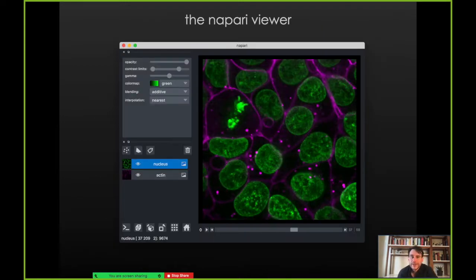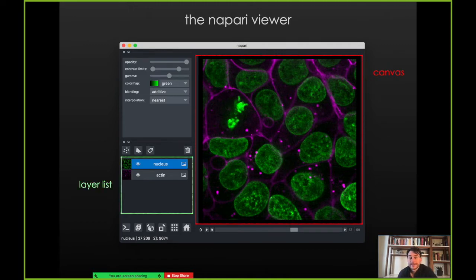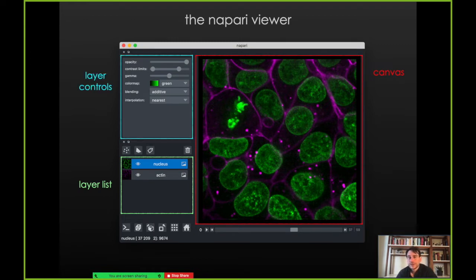At the heart of it is the Napari viewer. There is a canvas where you can see images on the right. There's a layer list which shows the data that has been loaded into the viewer already. And there are layer controls that depend on what layer you have selected. Here you have an image layer selected. You can see controls for opacity, contrast limits, gamma, color maps, and other things like that.